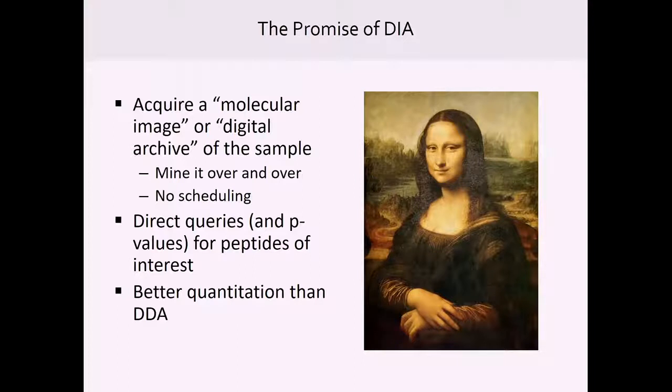it's definitely much better than using discovery data. And I've shown here on the right-hand side an image of the Mona Lisa, because one of the analogies I want to draw here is similar to this project where Google has generated these gigapixel cameras. Their goal is to generate a permanent record or a permanent archive of famous works of art, famous events and famous people.